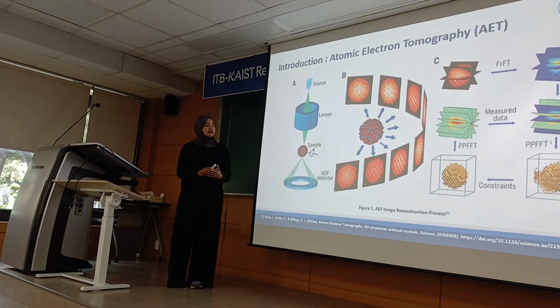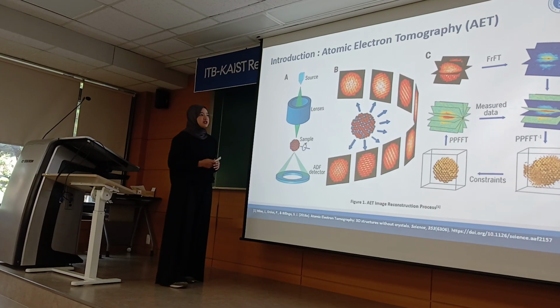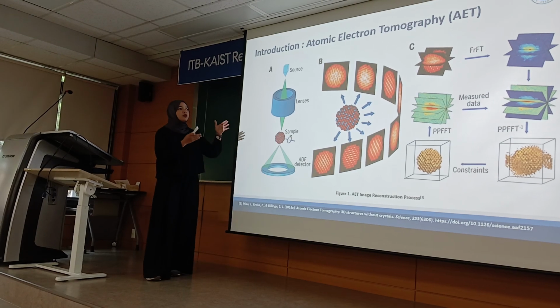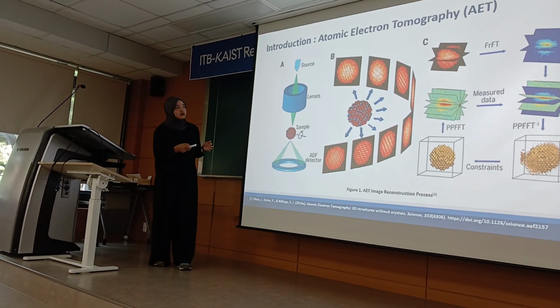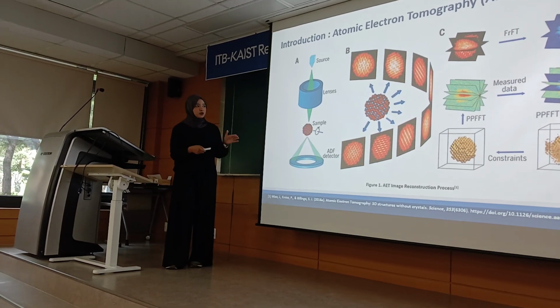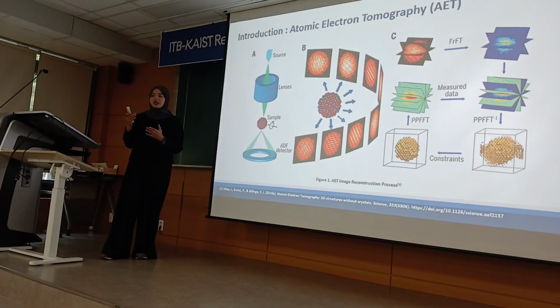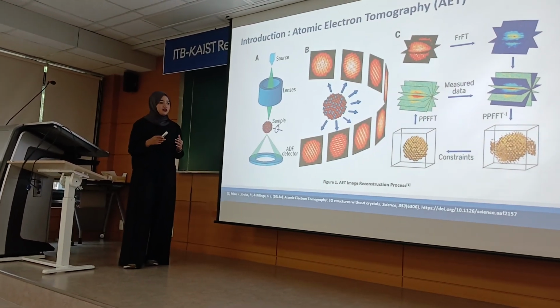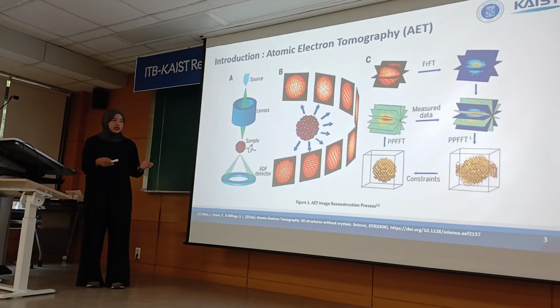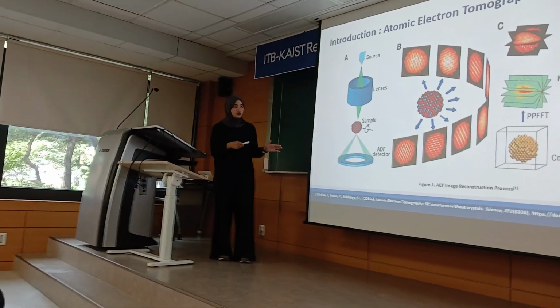And from the tilt series, we can do some computation using generalized Fourier iterative reconstruction, or GENFIRE. So basically we Fourier transform the projection series into Fourier slices, and we put the Fourier slices into the Fourier grid. But due to the missing information, due to the limited projections, there are several arbitrary numbers in the grid, and we can inverse Fourier transform to get the 3D volume reconstruction.